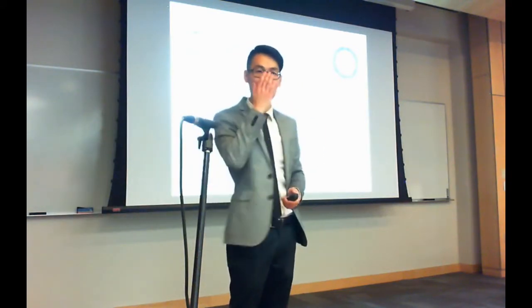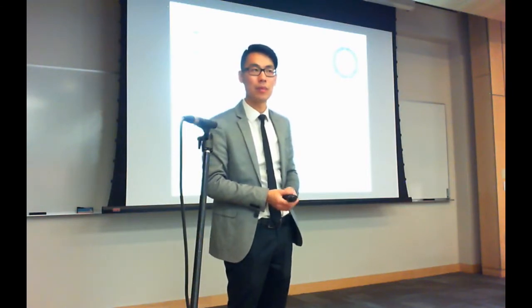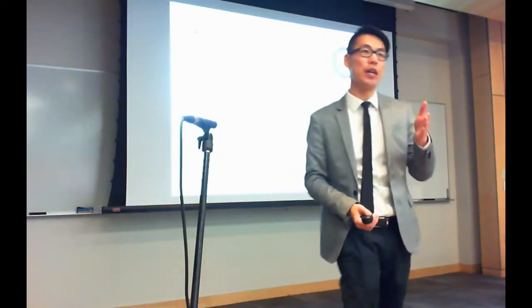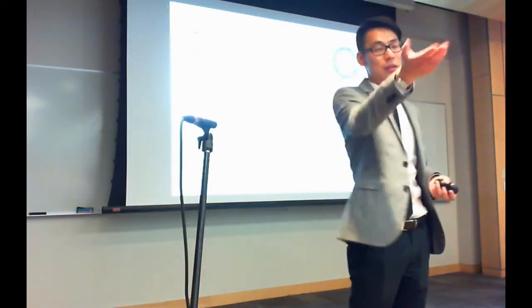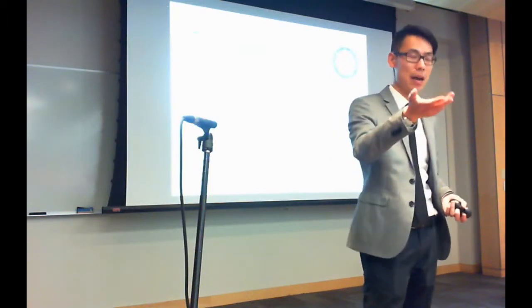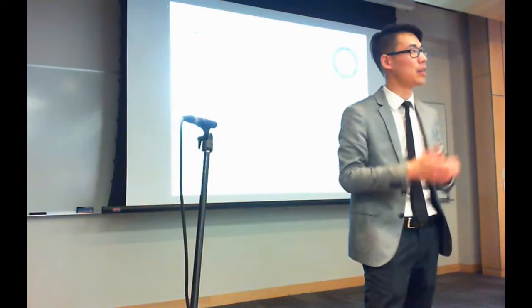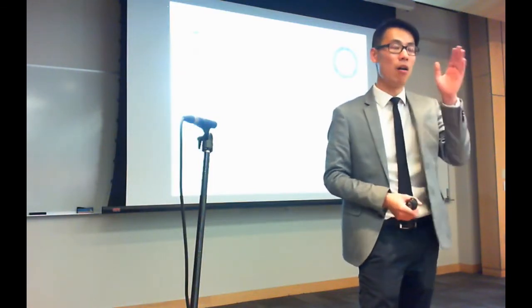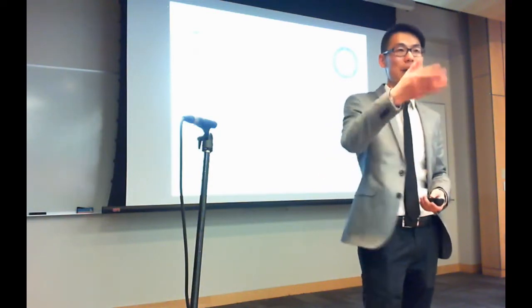And then how did you deal with modifications in the spectral matching? With modifications, we search for them with the database search. We include standard sample handling modifications and some biological modifications, I think six or seven, and we rely on the database search to tell us that the modifications are there.